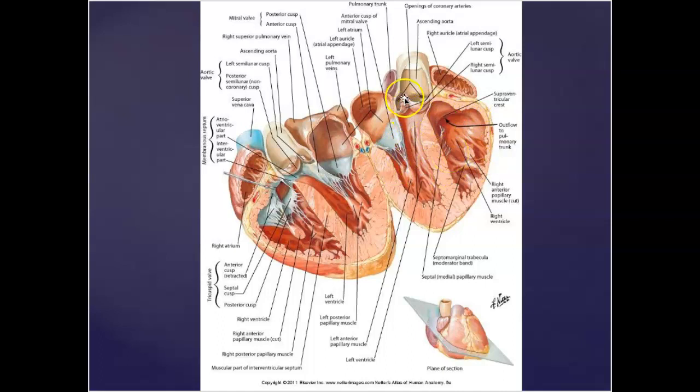This is just another interesting shot here too. Again, you can see immediately off of the right of the aortic semilunar valve as it pumps out the left ventricle, those chordae tendineae again are going to close up that bicuspid valve, not allowing blood back into the left atrium. The left ventricle contracts and it pushes out the aortic semilunar valve into the aorta, and then it will arch around, coming down into the descending aorta, into the abdominal cavity.